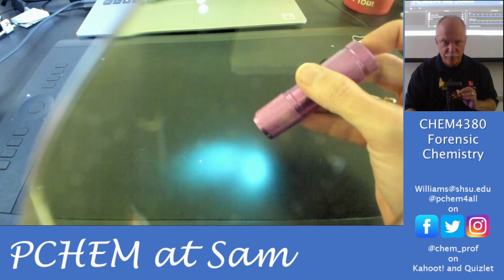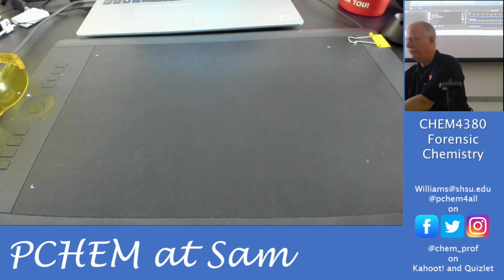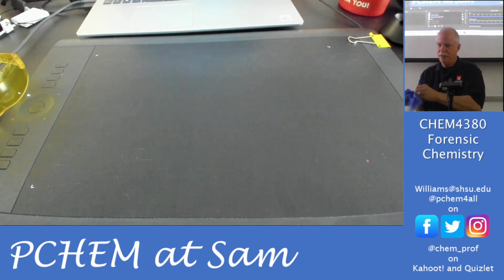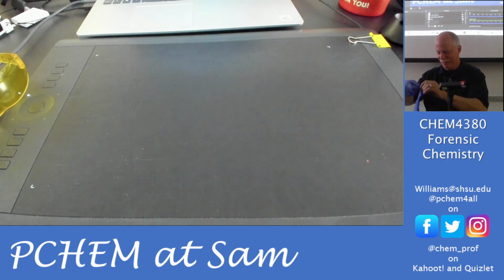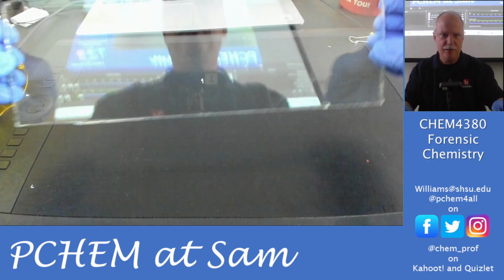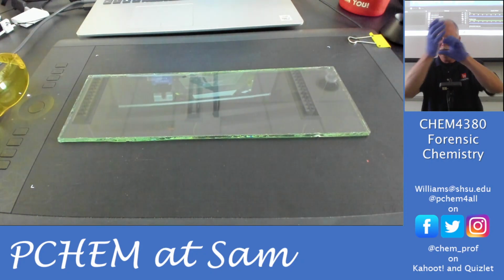There's another one. Okay. Now one thing I wanted to do was, I'm not really good at fingerprint investigation, but I'm going to try. Okay. I'm going to make a god-awful mess. So we'll see. My little tablet's going to be pink for the rest of the semester, I'm sure. Because this powder is so ridiculously fine. All right, so we have this plate. It's clean. There's nothing on it as far as I can tell. I cleaned it this morning.